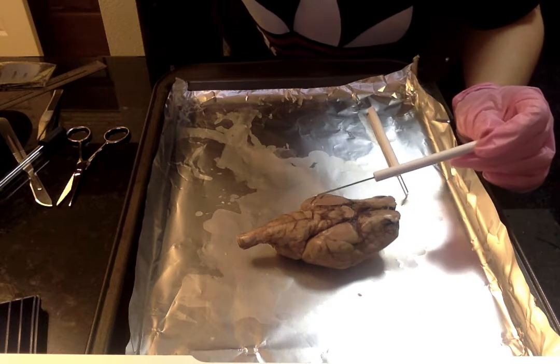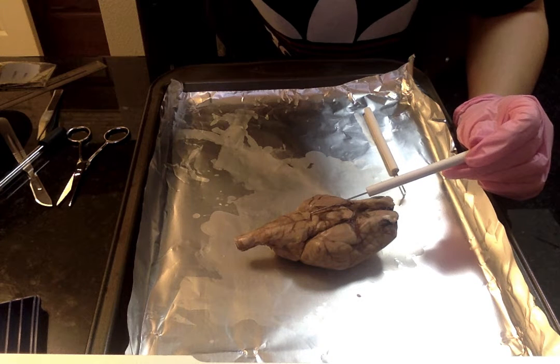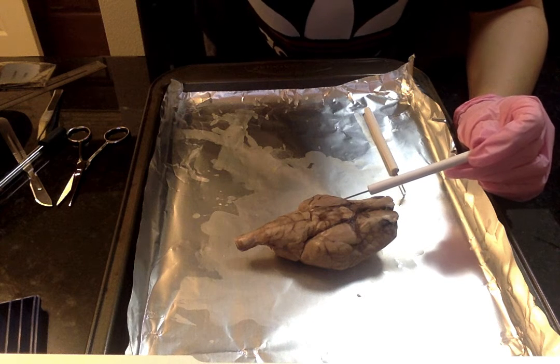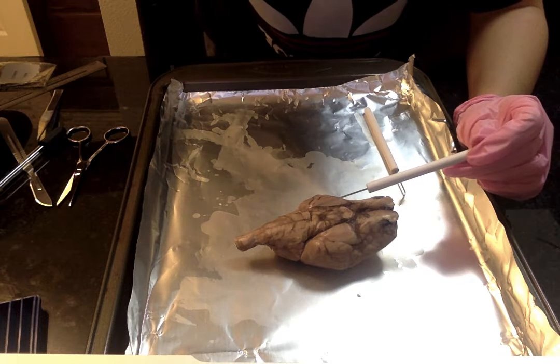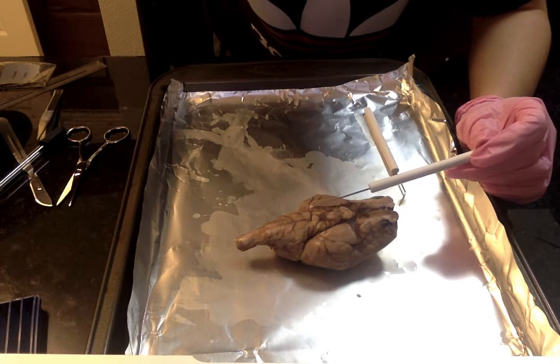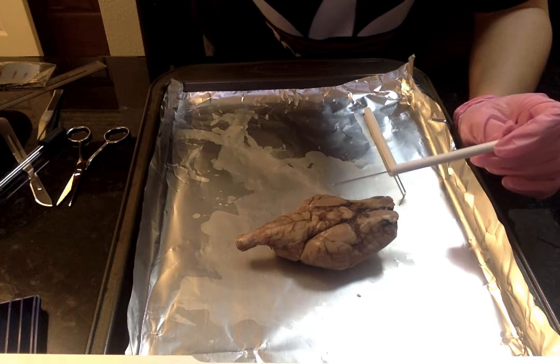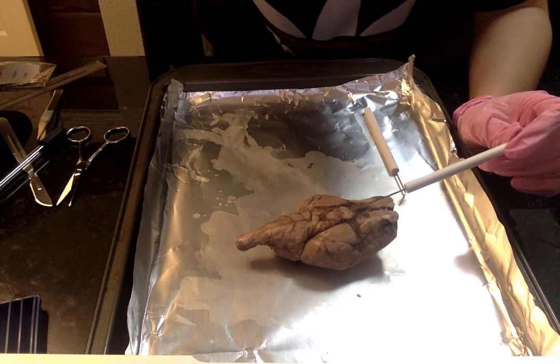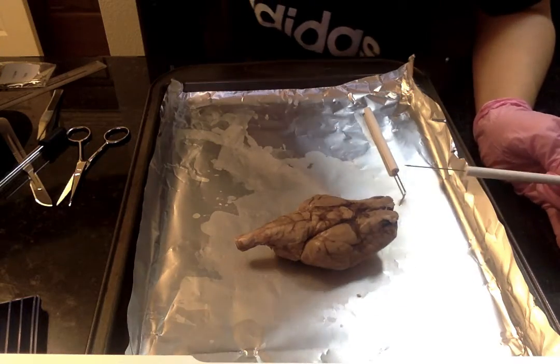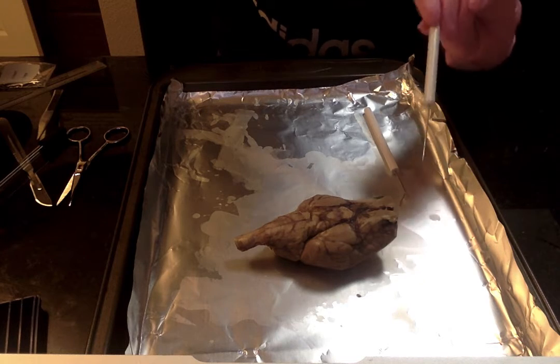The midbrain here is a portion of the central nervous system that deals with vision, hearing, motor control, sleep and wake cycles, arousal, and temperature regulation. The optic chiasm allows the visual cortex to receive the same hemispheric visual field from both of the eyes. The optic chiasm is right here, but this is kind of where the face would be.